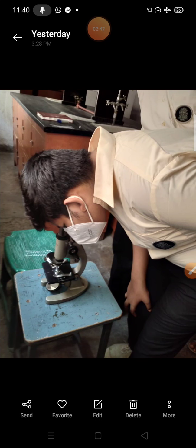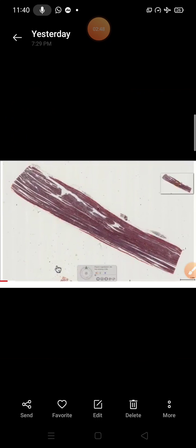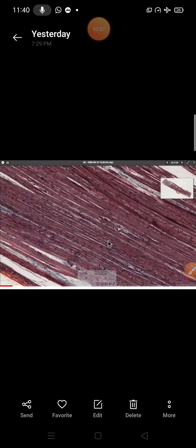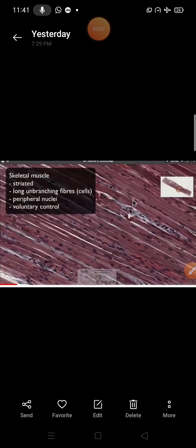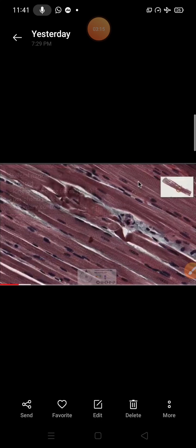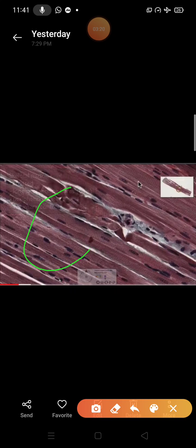Students, striated muscles are non-branching cylindrical-shaped cells, also called muscle fibers. They have peripheral positioning of elongated nuclei, just inside the sarcolemma or plasma membrane. Each cell contains a large number of nuclei. You can see here the number of peripheral nuclei inside the cell.